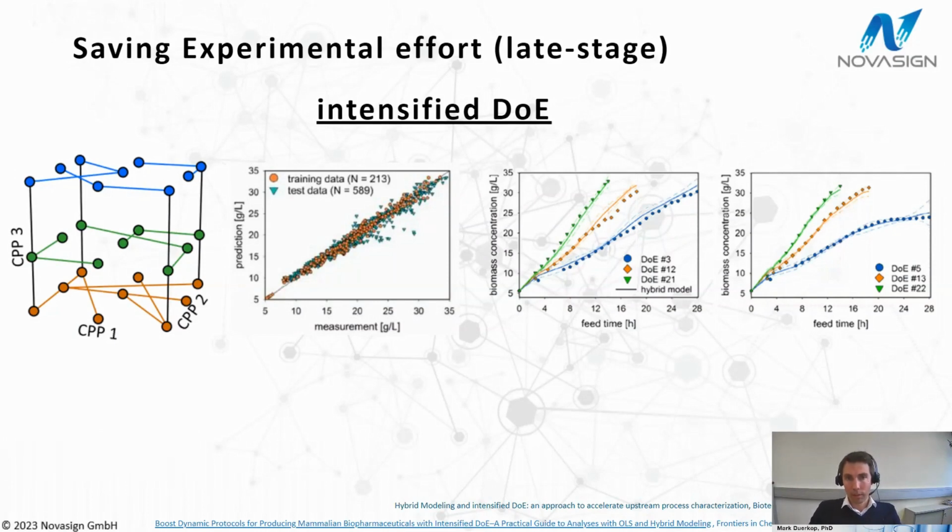And now how does this basically unscramble at the end? When you look at this graph in the center, let's say where this point cloud is, you see there's a prediction and there's a measurement, and the prediction basically describes what the model predicts, and the measurement is everything you describe by means of measuring. And the point is, if all of these points are on the diagonal line, that means your model perfectly describes your data.